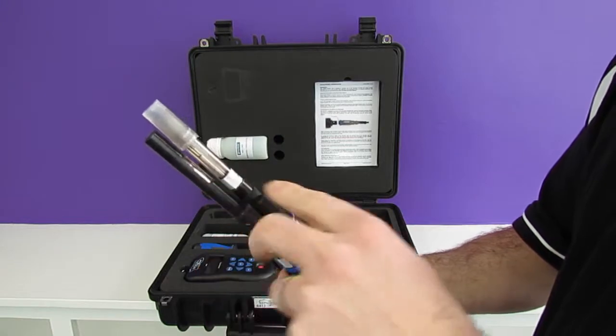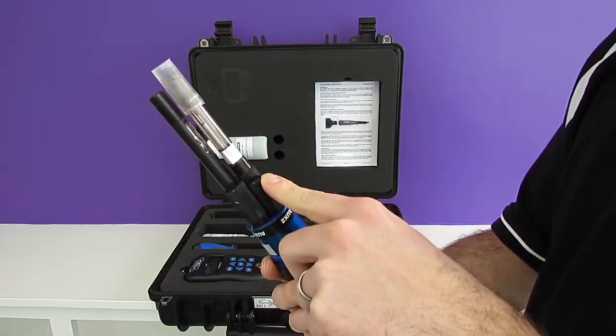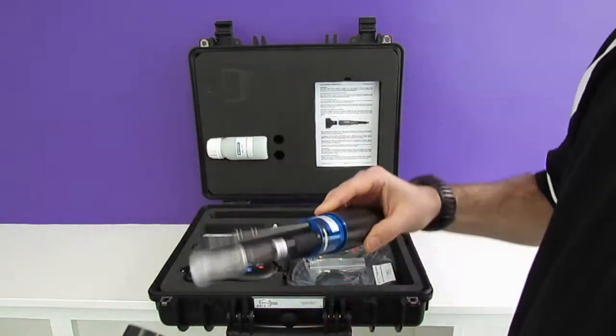We have temperature in here as well, and we also have our two auxiliary ports to allow you to add one optical, one ISE, or two ISE sensors to this probe.